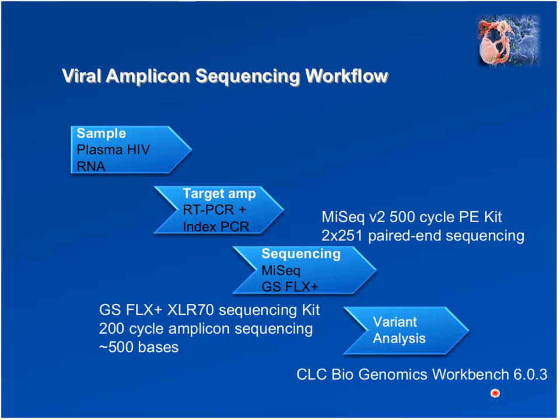By contrast, on the GS FLX Plus, all the kits to generate the data for the same 48 samples cost about $6,000. So quick calculation, basically that's about $120 per sample.